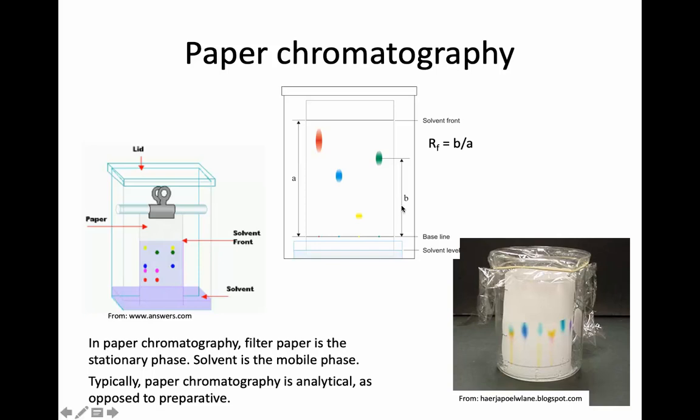So as you can see here, these are three different schematic depictions of paper chromatography, and you can see that different analytes have different retention times.